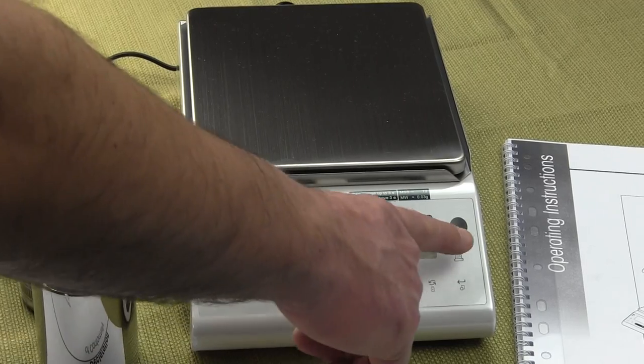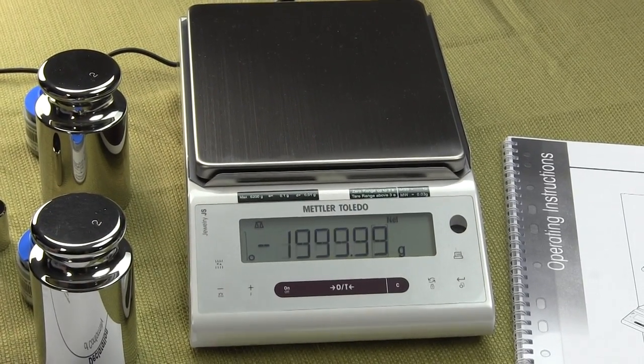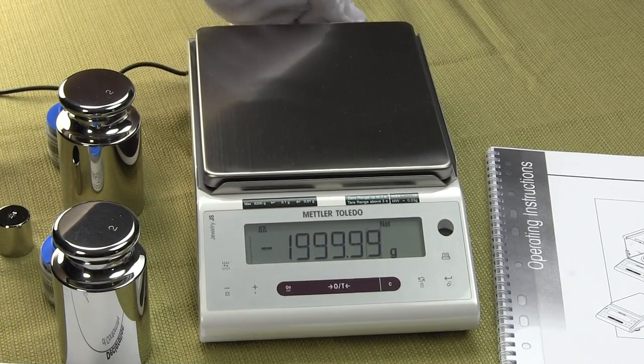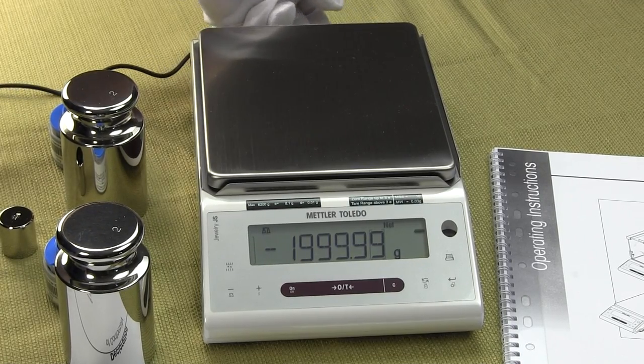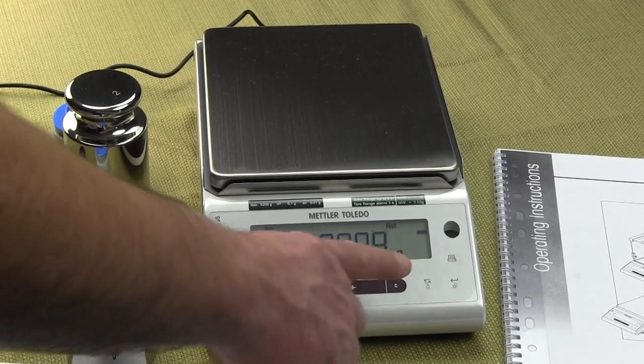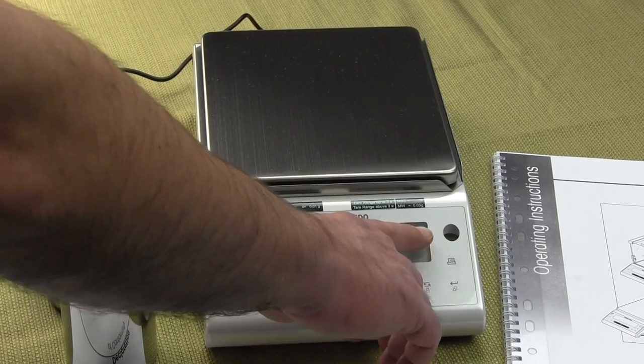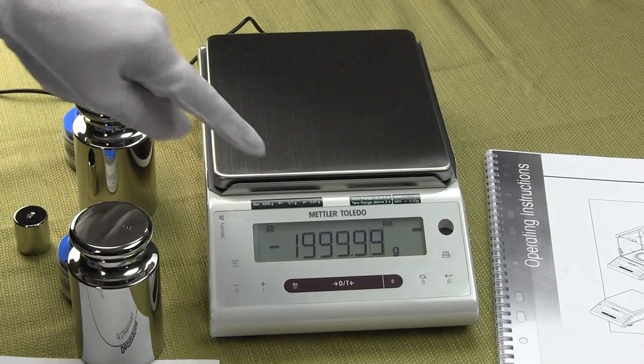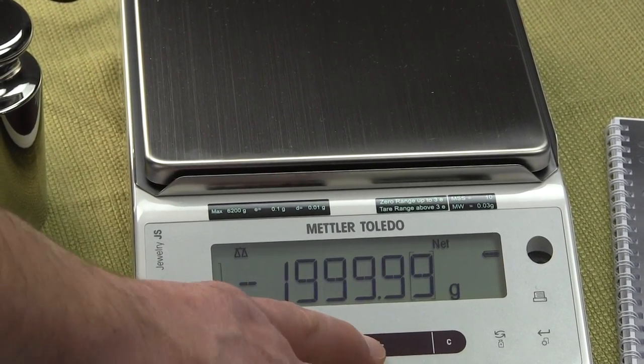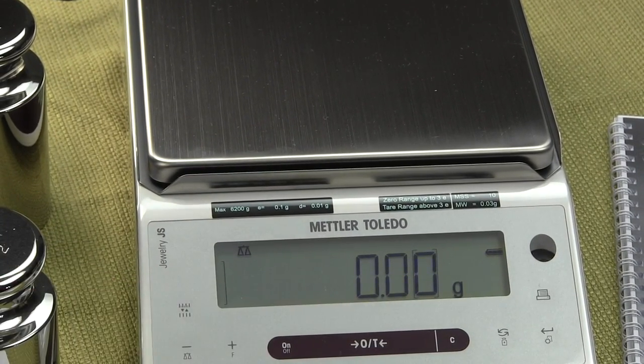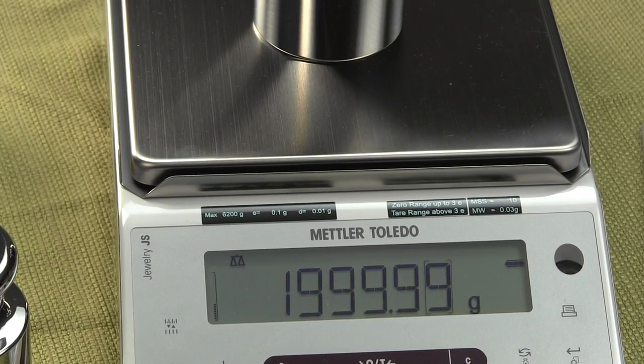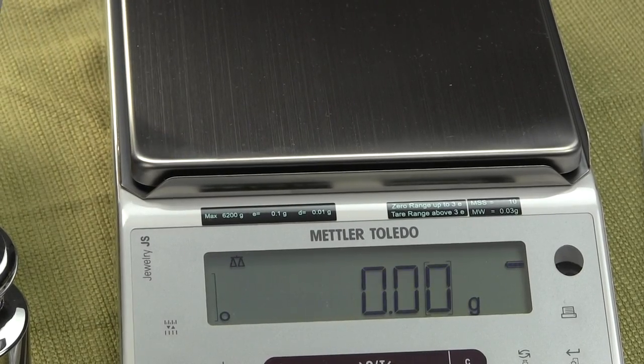Some more features about the balance, you have a spirit bubble indicator on the balance so that you can level the balance each time. Now the unique thing about this balance, if I unplug it, notice the balance never went off. That's because these new Mettlers can be operated off of regular batteries. This over here is showing you that it's under battery power right now. You can see the balance performs great either under AC adapter or battery power.